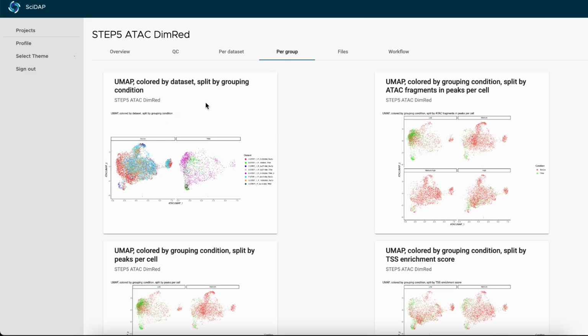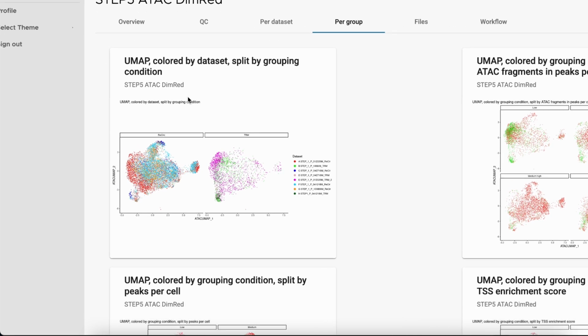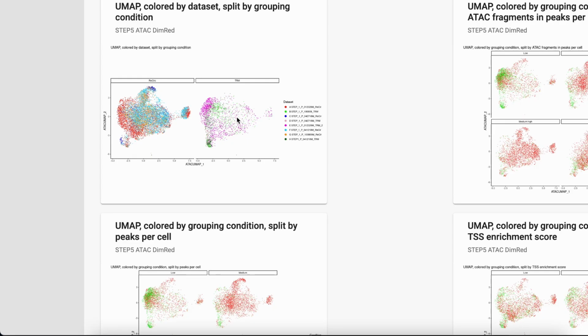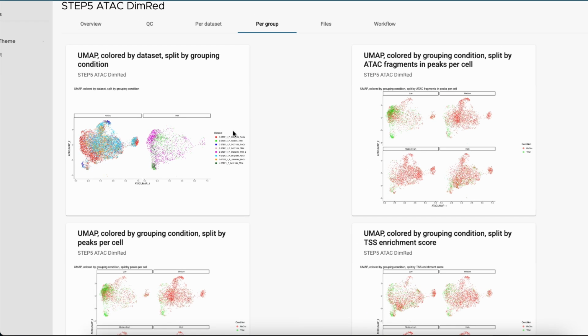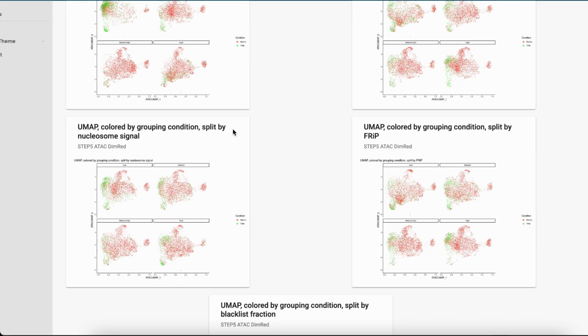Then the same thing, but per group. Interestingly, as in the case of our RNA, we could observe that ATAC peaks for our TRM group are not uniformly distributed between every cluster. On the last step, when we will be reviewing the output of WNN clustering, we may look into this closer. Again, this is all the same metrics, but for both groups.